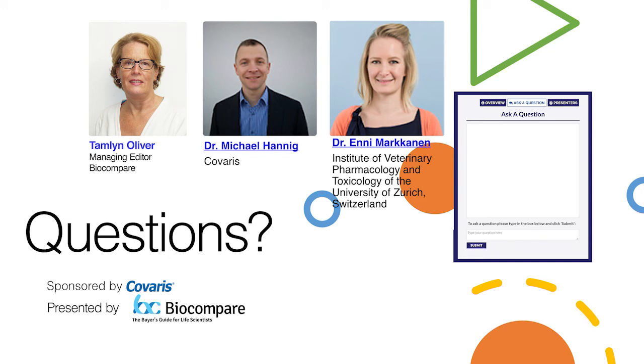So right now I'm struggling to find the word. It's the Clontech, yes, Clontech Pico input mammalian RNA sequencing product. So this really allows you to use extremely low amounts of RNA. So we routinely submit 4 nanograms of total RNA for sequencing. And that's enough per round.